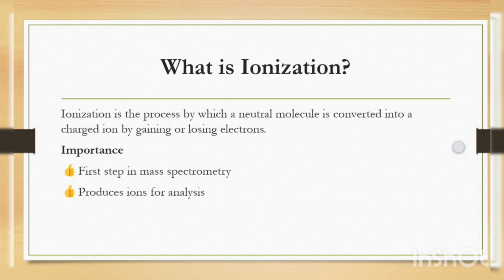Why is ionization important? Because it is the first step in mass spectrometry and it produces the ions that can subsequently be separated and detected. So, without ionization, conventional mass spectrometry analysis cannot proceed.